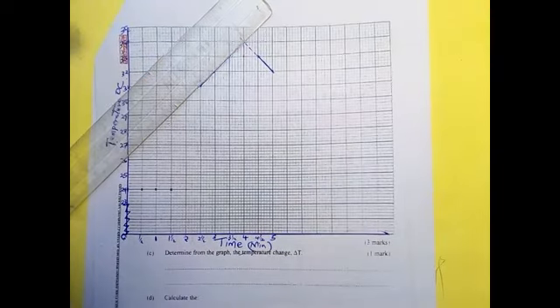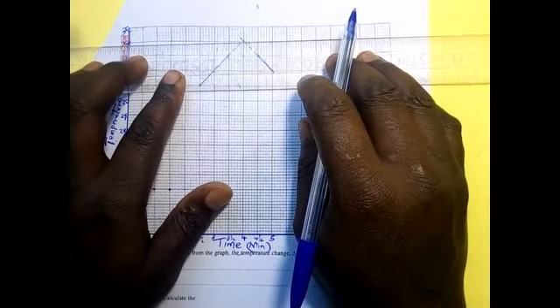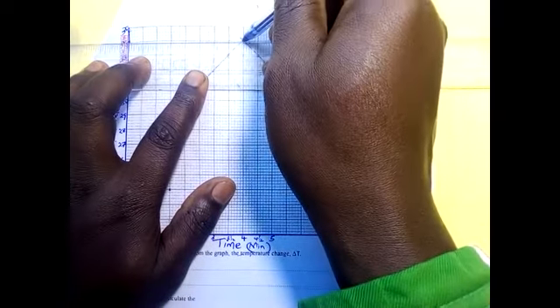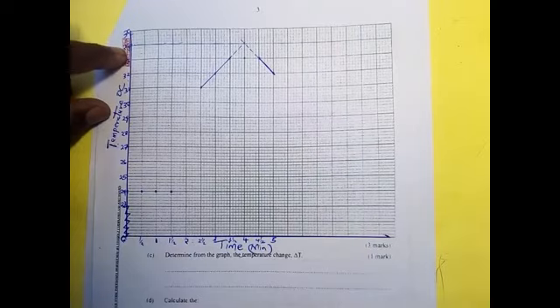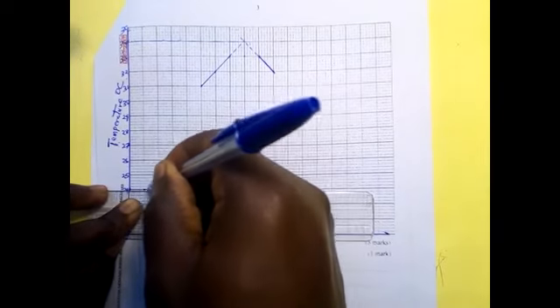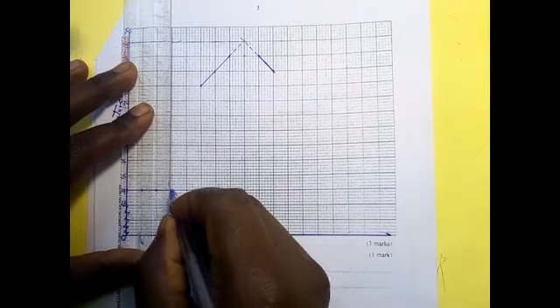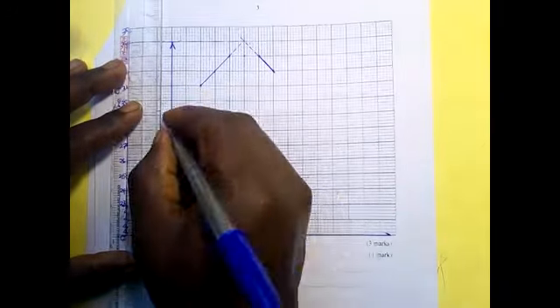Very good. Now we want to read our maximum. For us to read the maximum temperature, we use a dotted line towards the y-axis. So this is at this point. So our maximum is 34 degrees Celsius. Remember, let us also join this one, our room temperature. Now we are measuring the temperature between the minimum and the maximum here. This temperature here and here. This is what we are measuring.